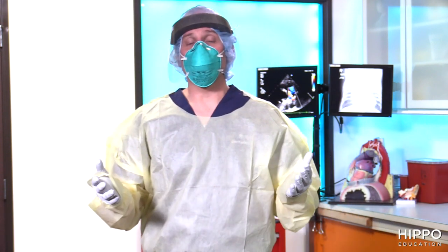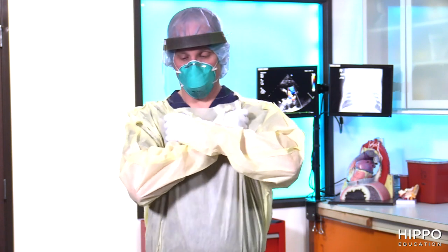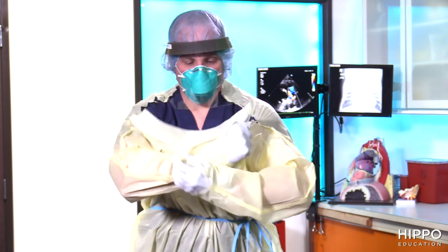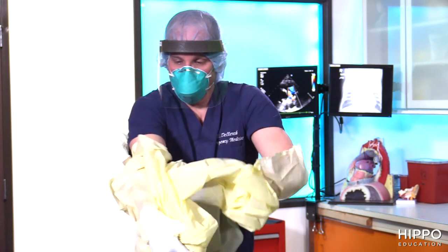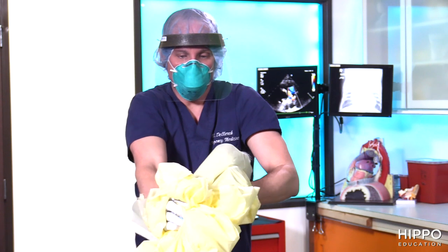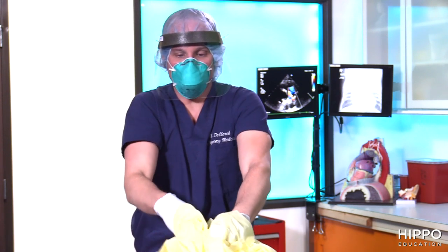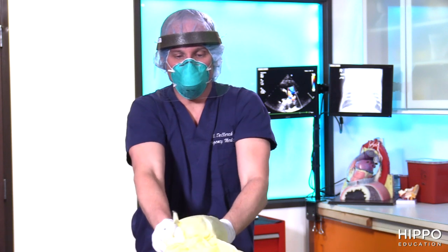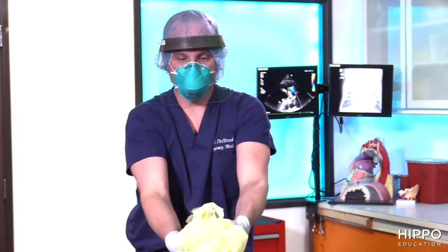The next step is removing the gown. I'm going to be pulling my gown off at the shoulder and at the waist, rolling those sleeves downward into a ball away from my body. I'll be taking a set of gloves with that, rolling it into a ball and throwing that into the trash.